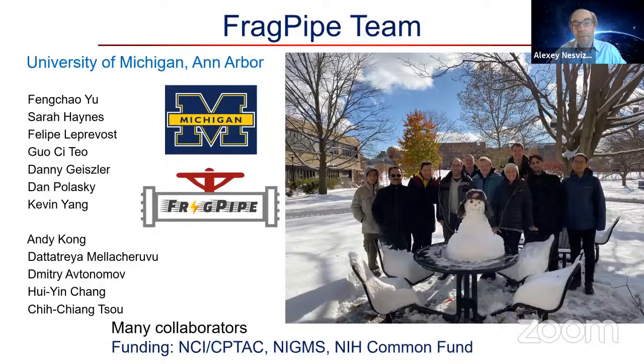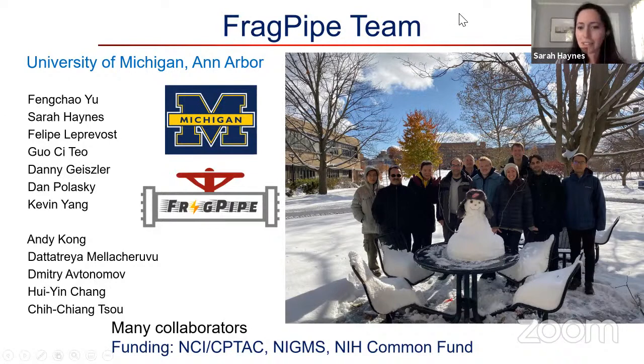But let's see if you have any questions now. Depending on that, if you don't have many, we'll soon go to the hands-on presentation, or rather a live demo that Sarah and Fengchao will do, and myself as well. Or we can spend more time on discussion. So I'm going to stop here and see how we should move forward. We have a lot of really good questions. Maybe we can go through some of those before we start the demo.